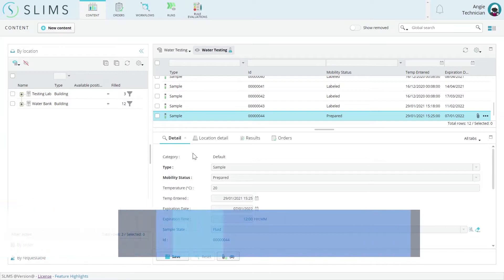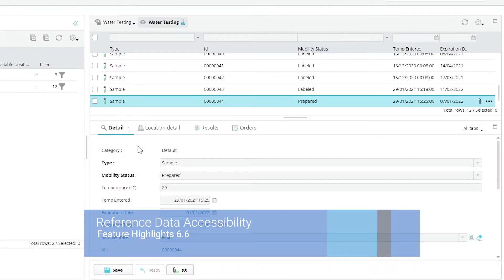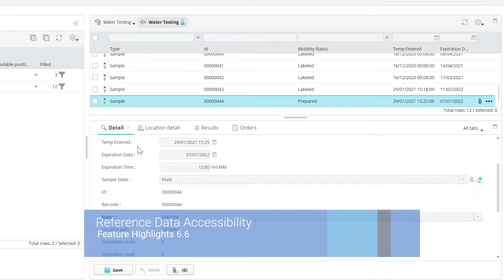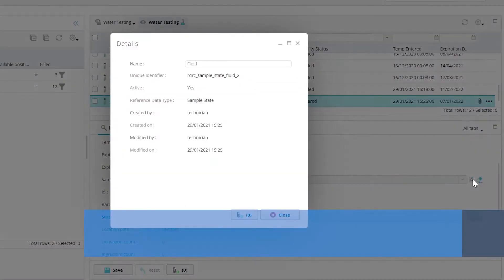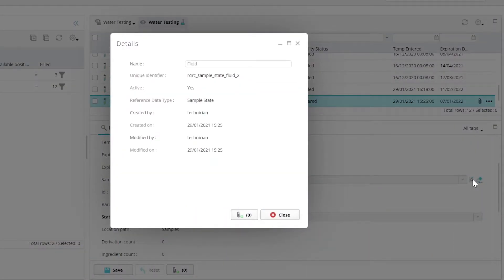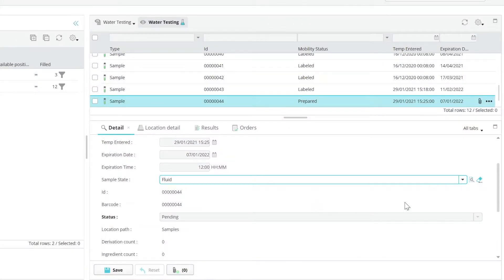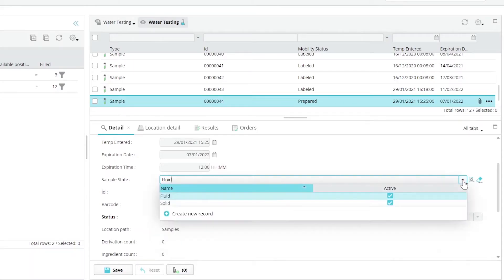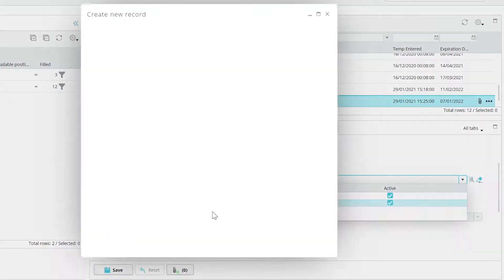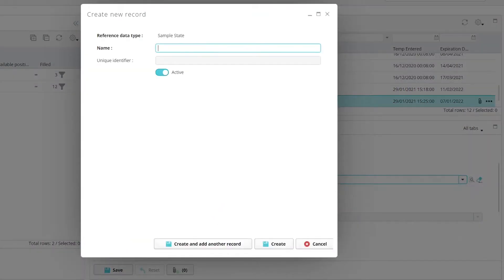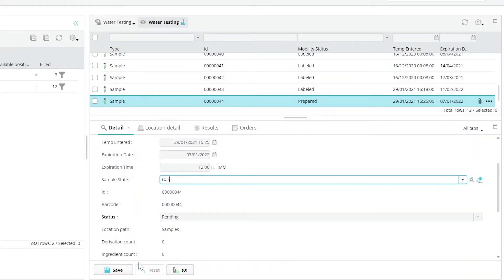Depending on the field setup, users with the appropriate role access rights can view the details of reference data records next to the field on the form. If reference data records are missing from the field, they can be added right from the dynamic choice drop-down if the field is set up to allow it.